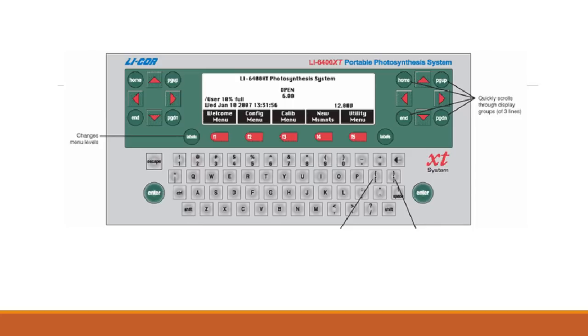Then select new measurements. For that we need to press F4. In the display, select open log file. For that, press F1. Give the file number and name and press enter.